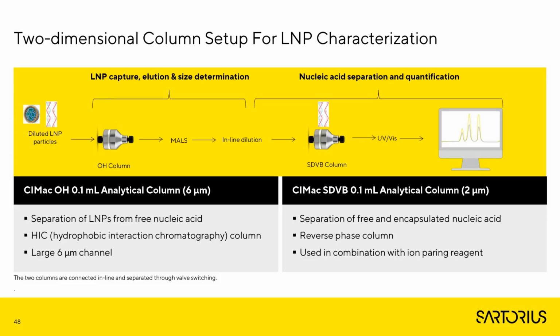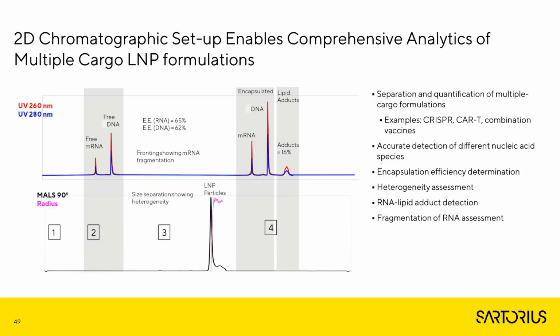And then we are doing an inline opening of our particles, so we don't need any detergent or any reagents to be able to open this particle. We utilize the inherent properties of very hydrophobic surfaces like the SDVB that are able to lyse and open the particles in this manner. So we are directly collapsing the particle structure on the column, and then we are eluting separate components from the column: the nucleic acids, the lipids and some of the impurities.